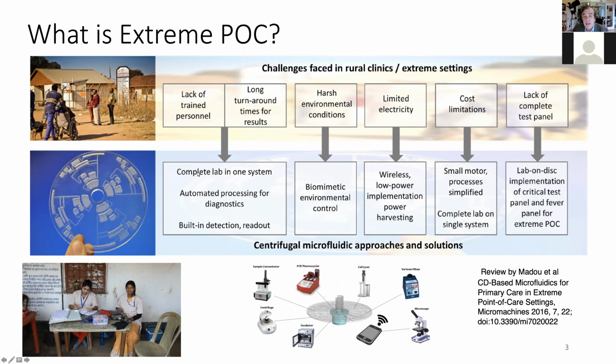So if we could have a complete lab in one system and automate the processing for diagnostics with built-in detection readout, we would make the life of people doing these tests in the field much simpler. In other words, you kind of own a box with just one button. You push the button and that's all you need to do. You do not need to have a high-level education to run the machine.